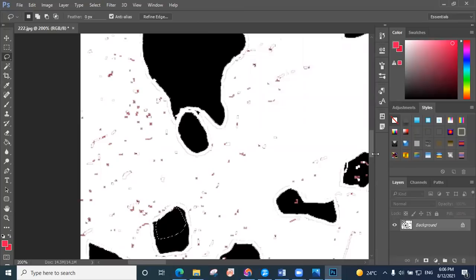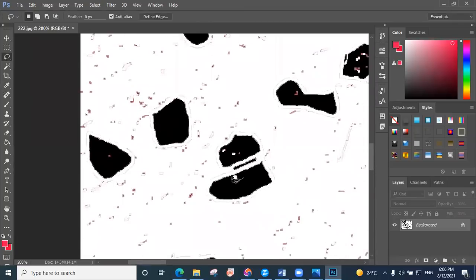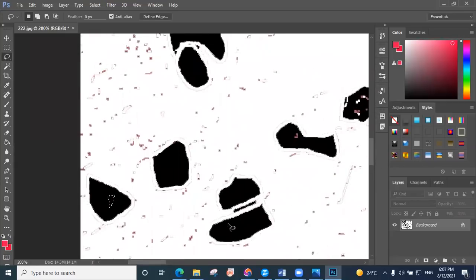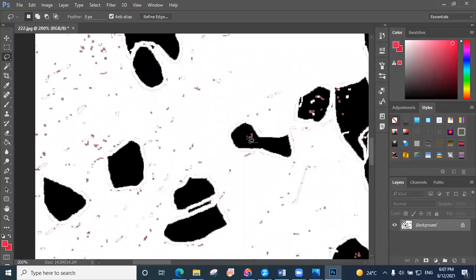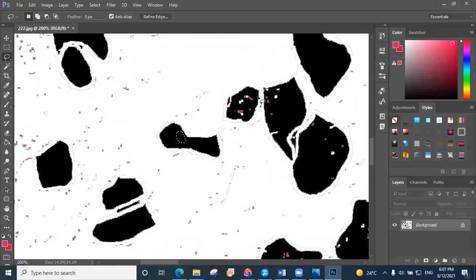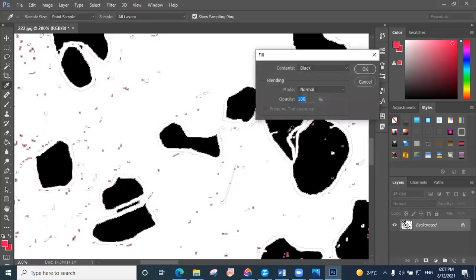Believe me, it's the best way to calculate the grain size without errors, or with just small errors. Because nothing has zero error, everything has error, but this reduces the errors and mistakes in calculating the grain size. Just spend a little time, and then everything will be all right.